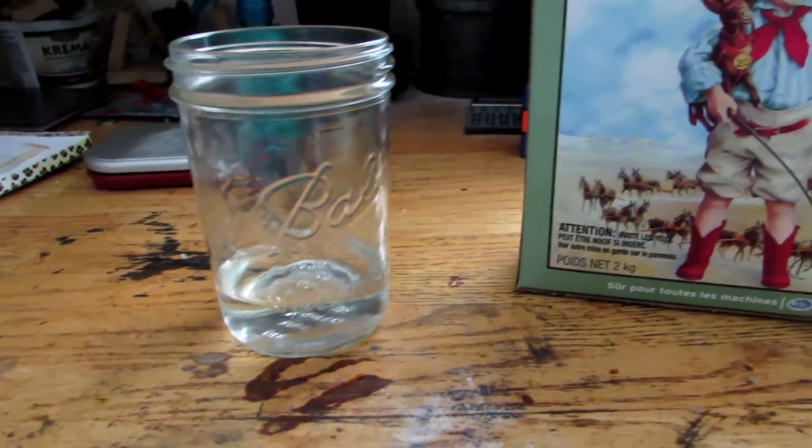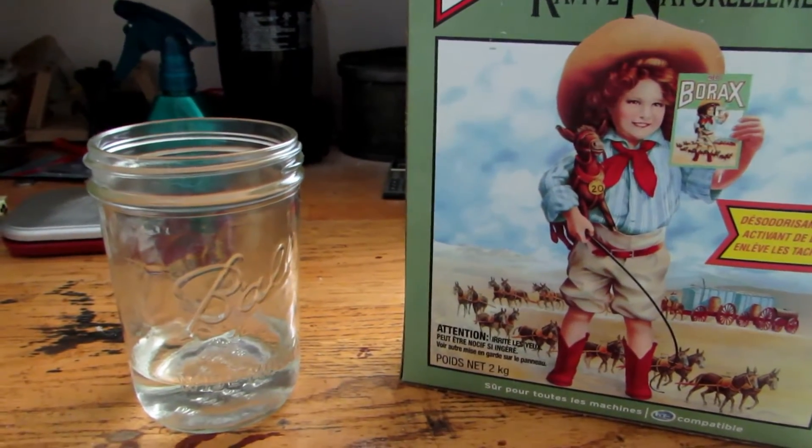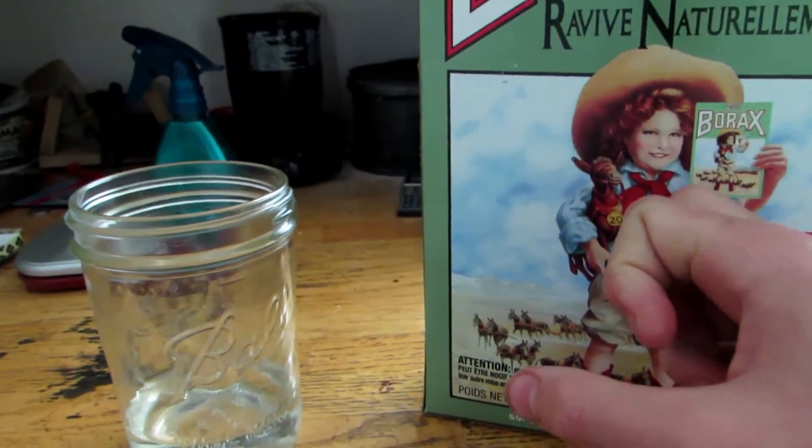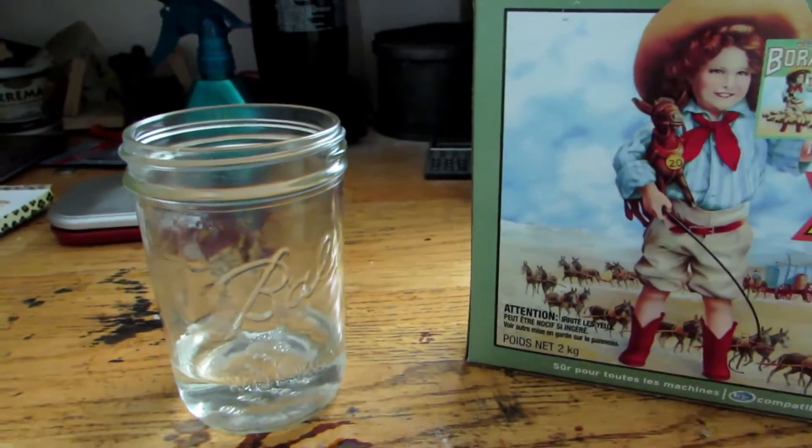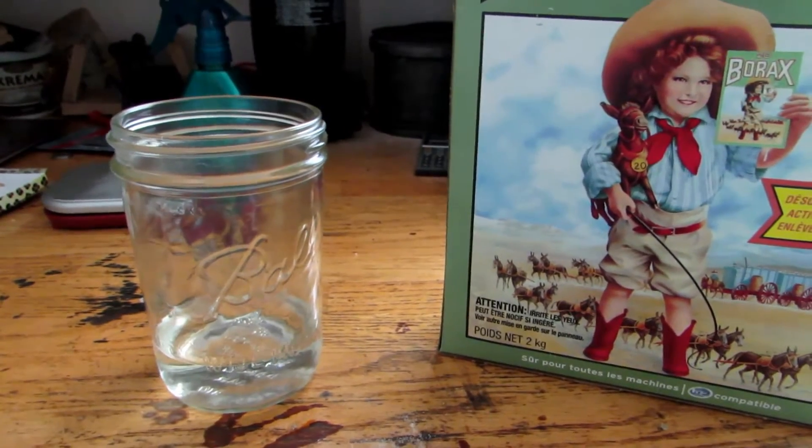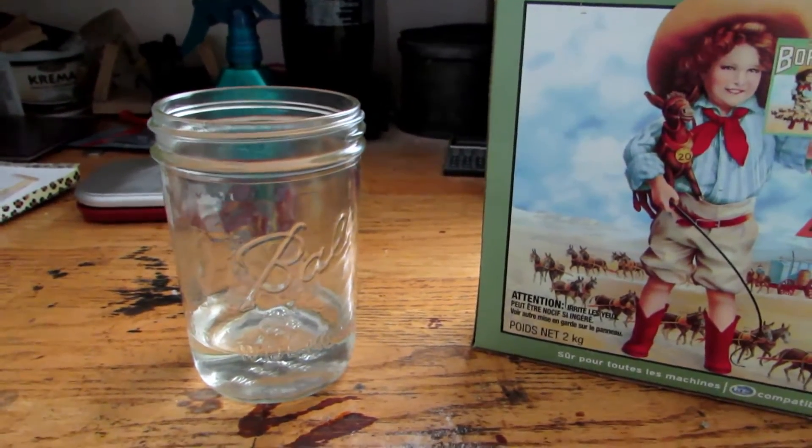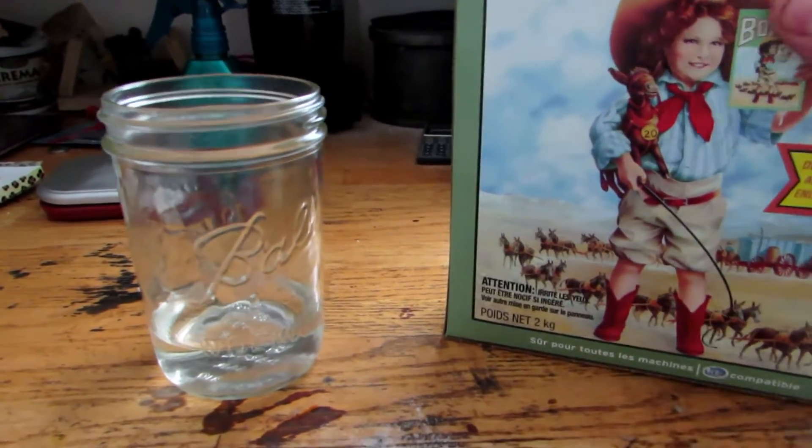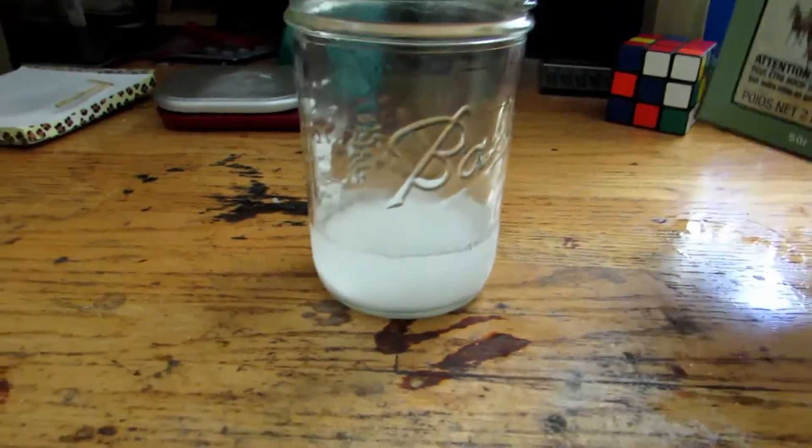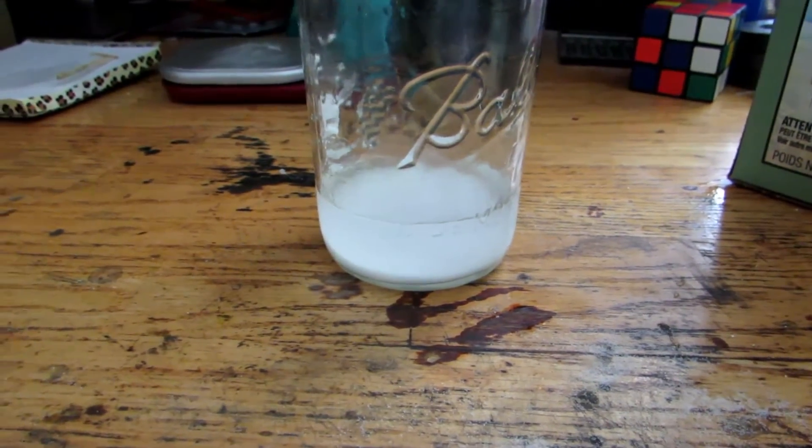First we're going to need to make boric acid. We'll need some hydrochloric acid, which can be sold as muriatic acid at Home Depot, and borax and water. First we need to create a saturated solution of borax in the water and make sure everything is dissolved. This will ensure that if any boric acid is precipitated when we add hydrochloric acid, there will be no contamination from unreacted borax crystals.